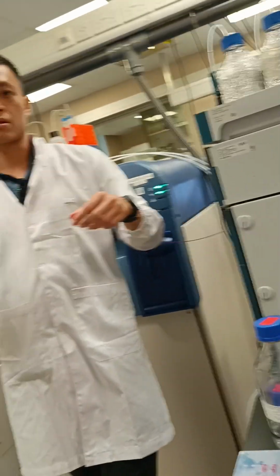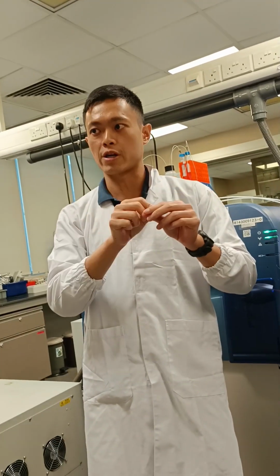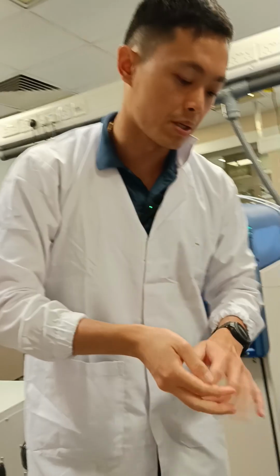That's my QC sample. Every time I run, I take some of the QC sample and extract it in every batch. So I make my own QC samples basically.